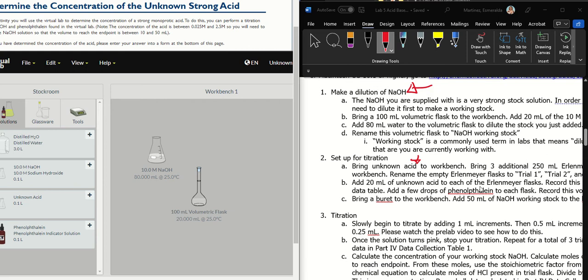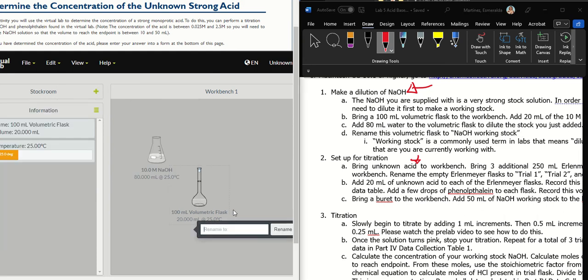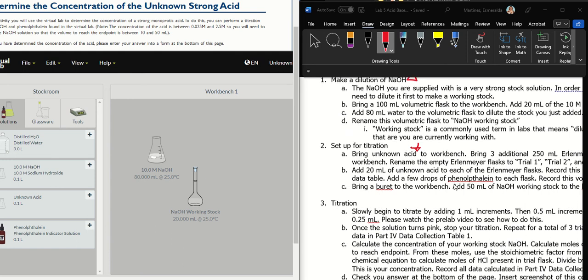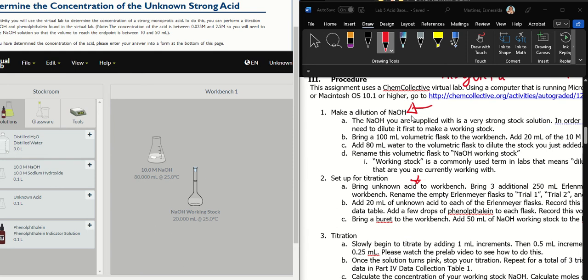And you are going to add 50 ml of your working stock to that burette. Now, something I kind of glossed over. I was talking about the working stock. You should rename your volumetric flask that contains that working stock. You should rename it that way. So you do that by right clicking, rename. Just so that you know, you know what is what. It's just easier, right? Like in the lab, you would label everything with either a piece of tape or with the special pencil that you can use on glassware. But we're doing the same thing here. Okay. So now you've made your dilution, your working stock, and you set up for titration.